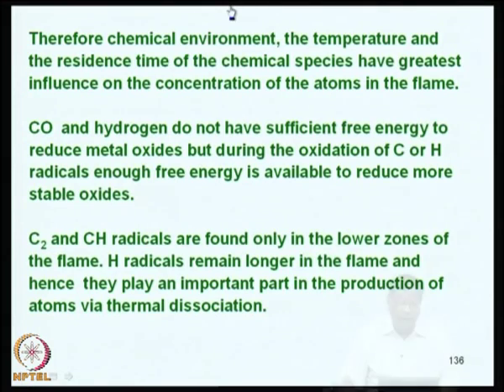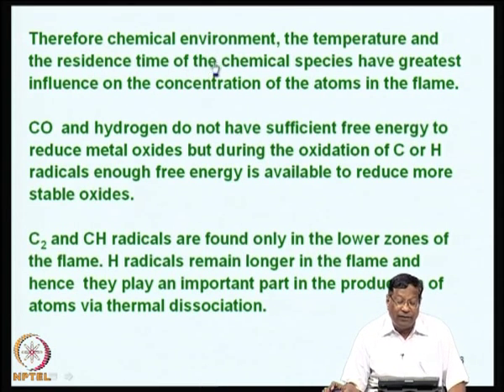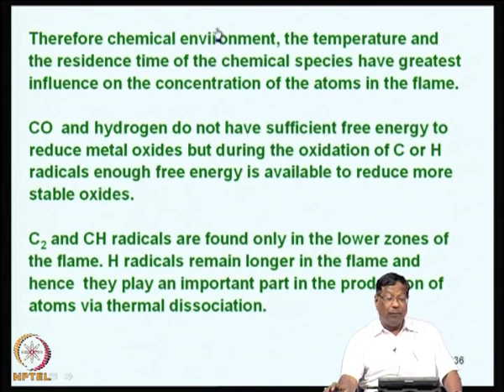So, the chemical environment, the temperature and the residence time of the chemical species have the greatest influence on the concentration of the atoms in the flame.